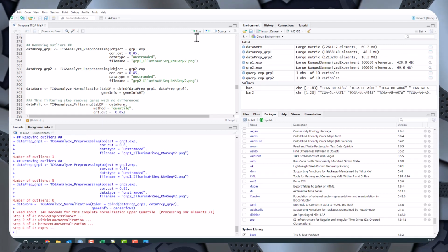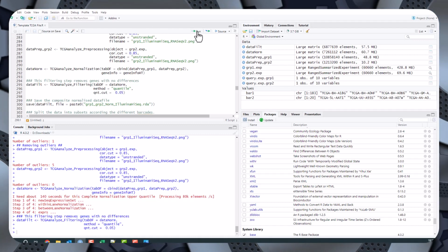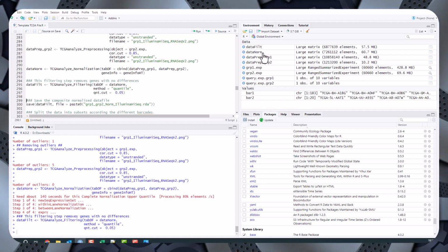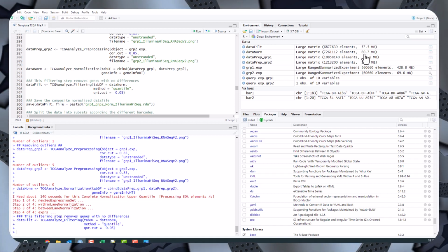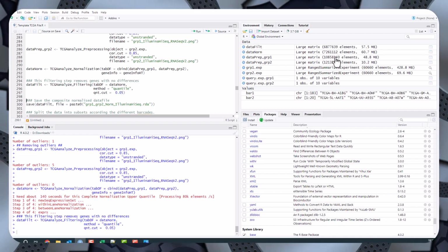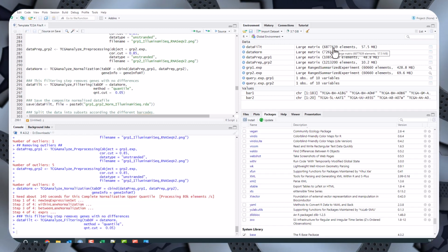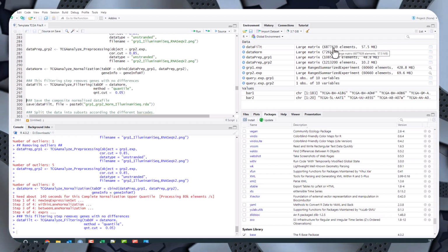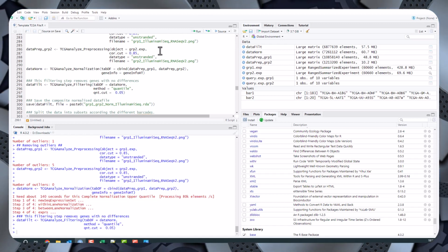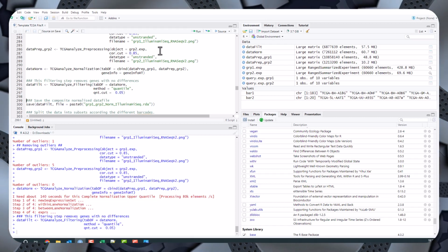Once that's all done, the next step does a filtering to get rid of anything that's particularly boring, because they're unimportant genes. If you look here, after normalization, you've got a file which was 60.7 megabytes. Now you've got one which is 57.5, because quite a lot of the genes are not different between any column and between any patient. They might be always 0 or always exactly the same number. Most likely always 0.